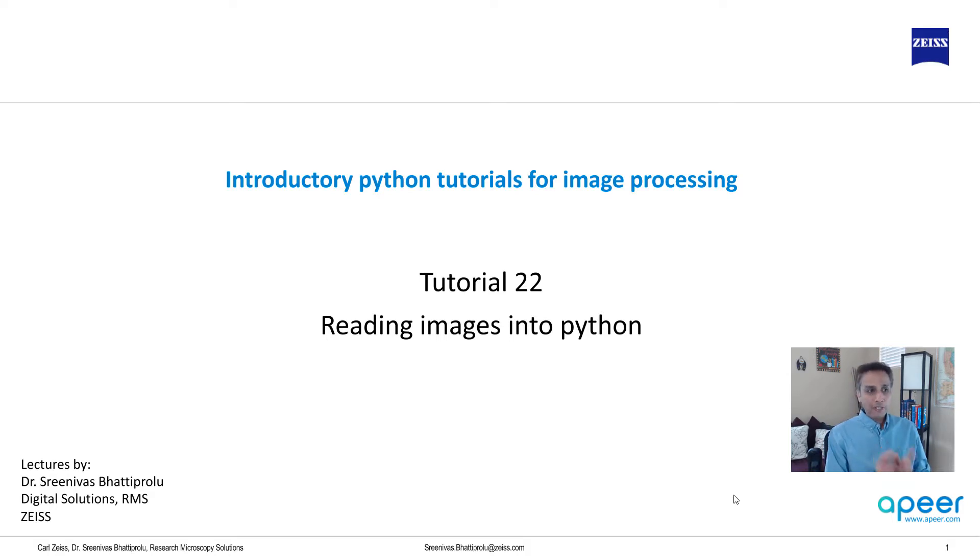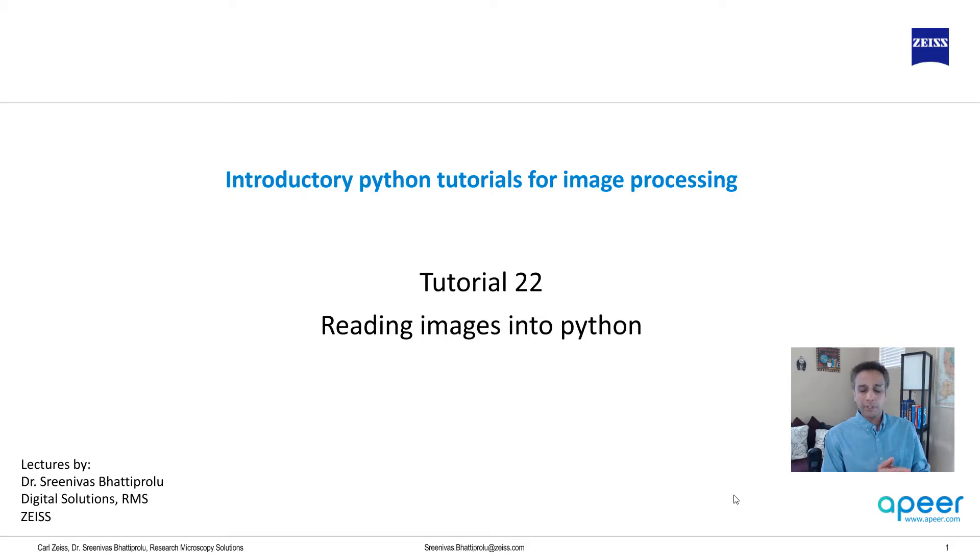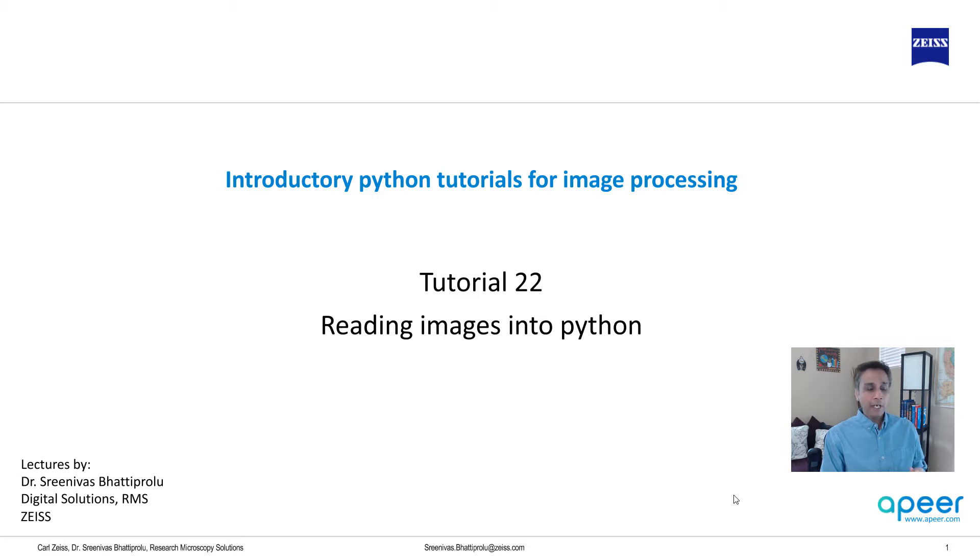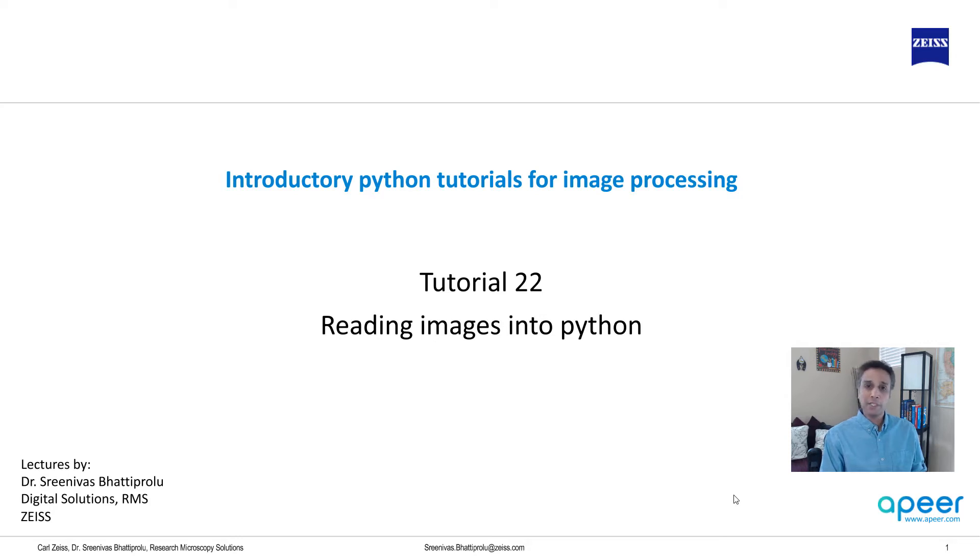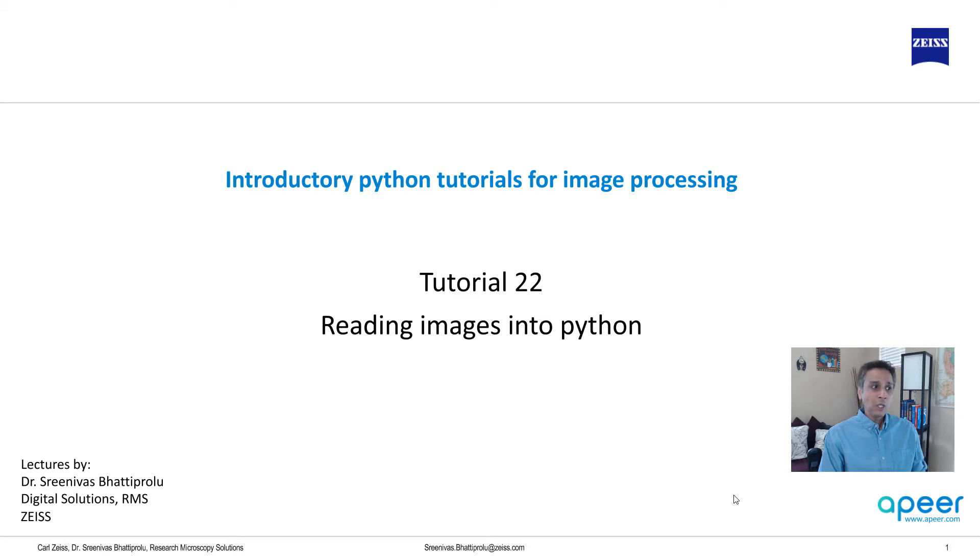Now in this video I'm going to talk only about reading standard images like TIFF, JPEG, and PNG and so on, but not proprietary images. I'll save that for the next tutorial. When I say proprietary images, that means .czi for Zeiss images. So let's jump into Spyder to understand how to read these images.